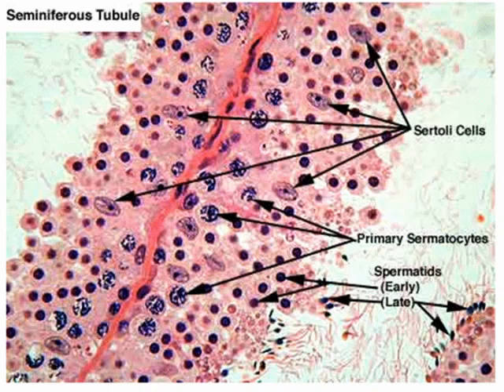Now, after you've studied exercise 50, you'll want to go to 51, and we'll look at some slides of the ovary.